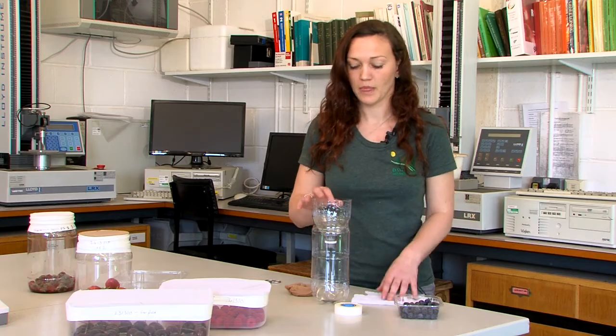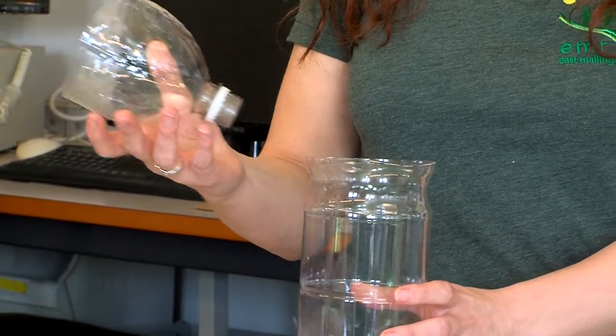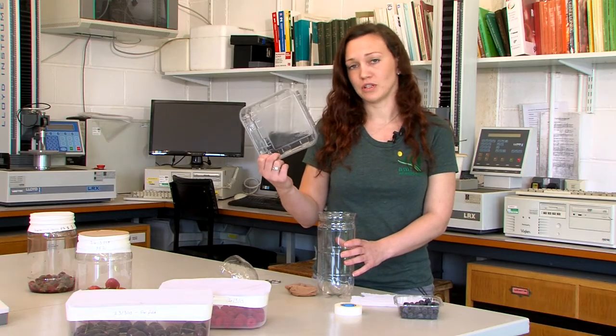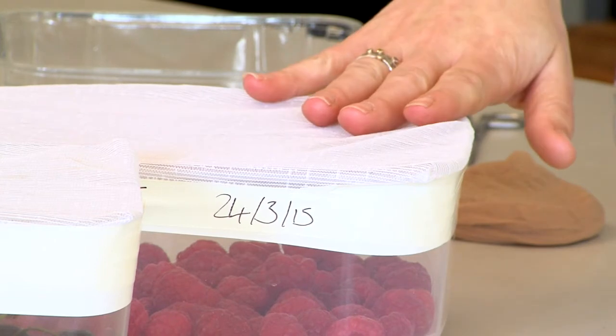The reason we cover the container with a mesh is that if we were to seal the container, noxious gases can build up and kill any of the life stages that are within the fruit. For the container, I'm using a 2 litre drinks bottle that I've removed the top from. You can also use other clear containers such as punnets, as long as there are no holes, and lunch boxes.